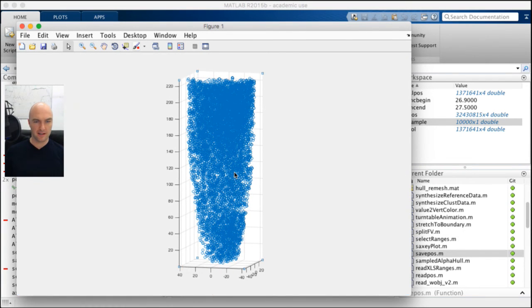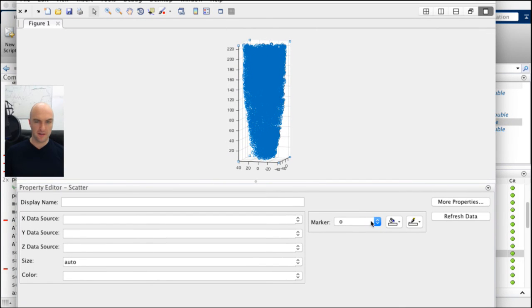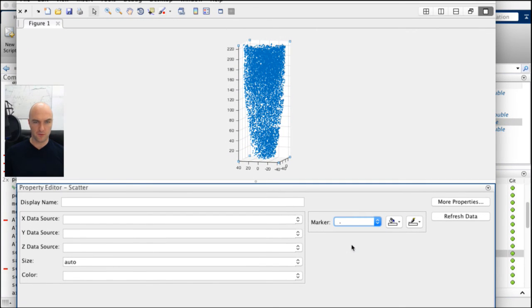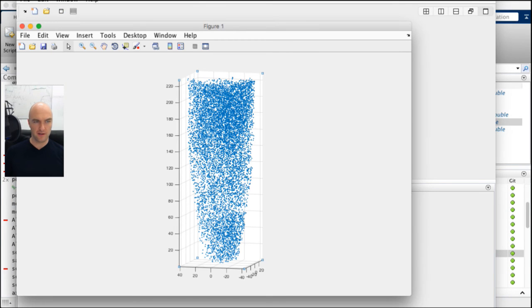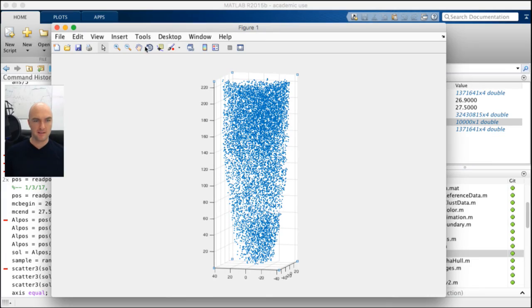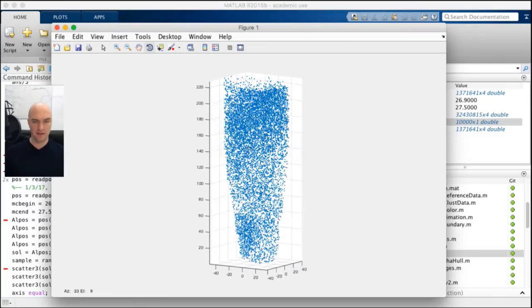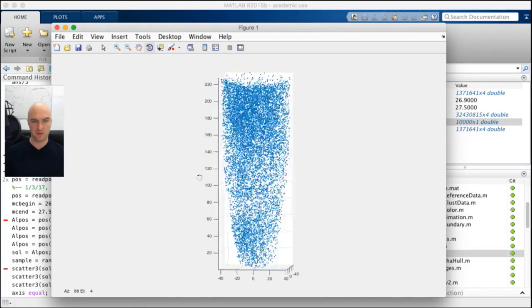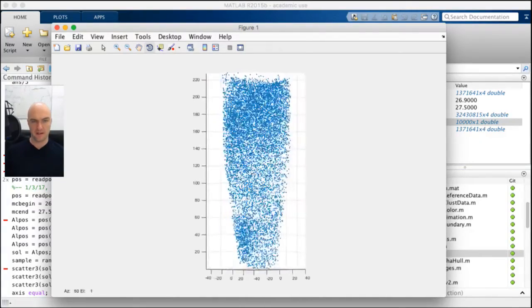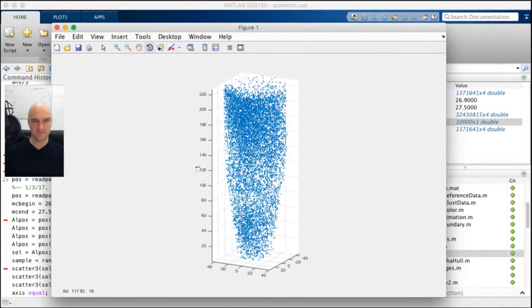The next thing I'd like to do is opening the plot tools. And in the plot tools, we'll change the marker to a point. This is usually a lot more convenient for atom probe data. Anyway, this is now a display of the aluminium, and you can already see there is a precipitate here which contains aluminium. I think tantalum would have the strongest partitioning in that data set.